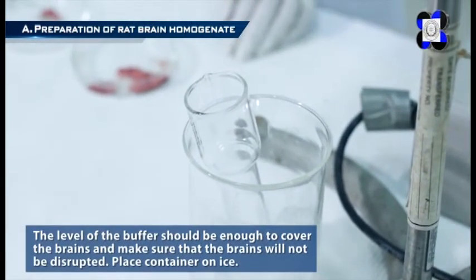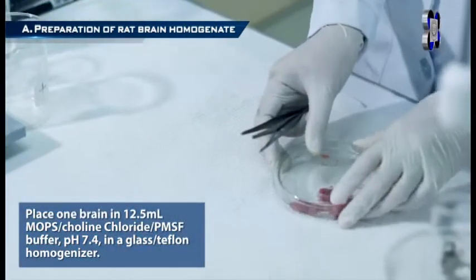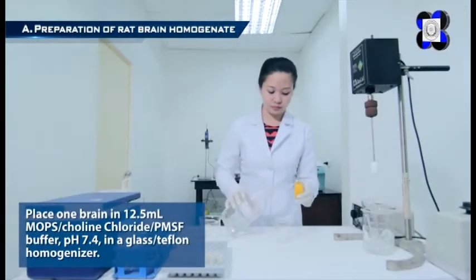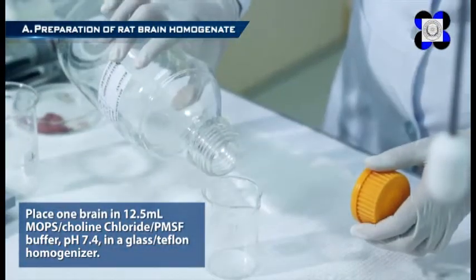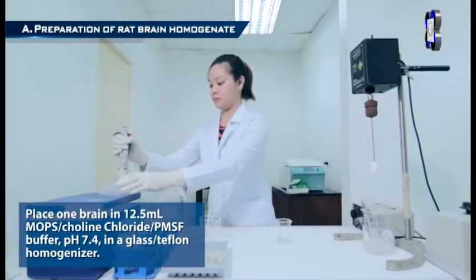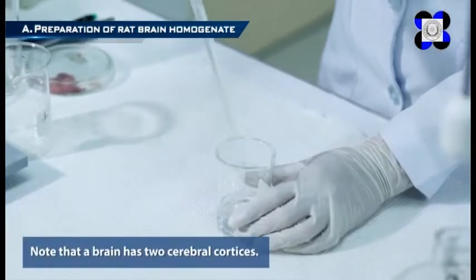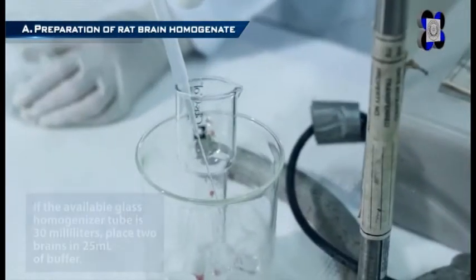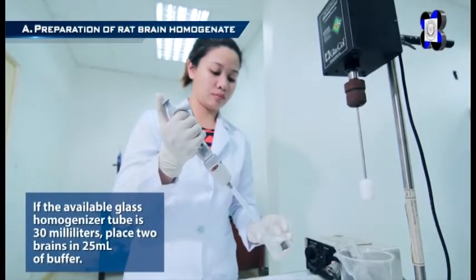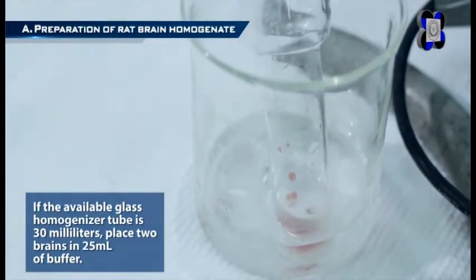Place the container on ice. Step 2: Place one brain in 12.5 milliliters of MOPS Choline Chloride PMSF Buffer at pH 7.4 in a glass or Teflon homogenizer. Note that a brain has two cerebral cortices. If the available glass homogenizer tube is 30 milliliters, place two brains in 25 milliliters of buffer.